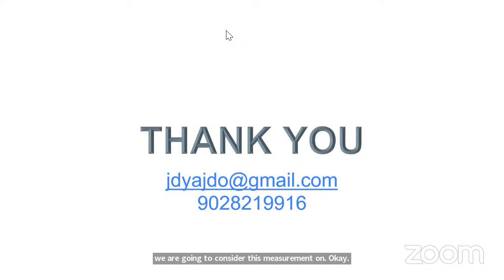Enable precision check in test parameters, we will show internal QCs. We run 20 samples for the test parameters. Yes, that is fine. No problem. You can perform those precision checks with the help of 20 samples. Measurement traceability, again, as I have mentioned, if time permits, we will take the details on this tomorrow.